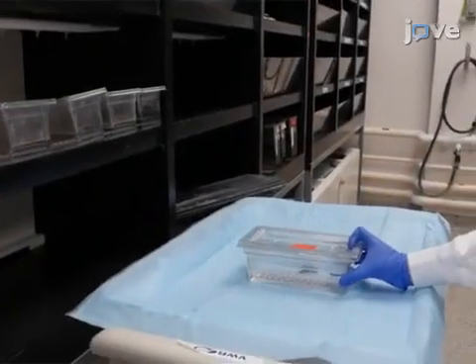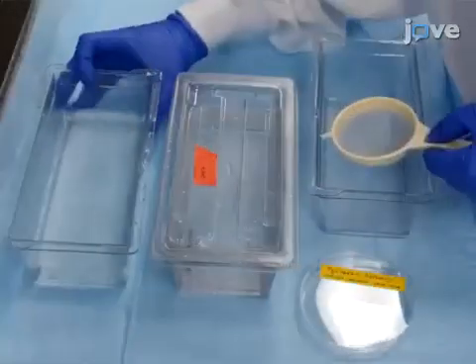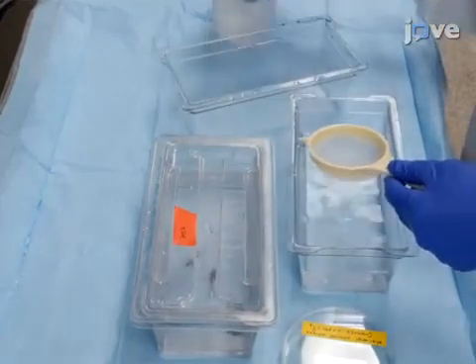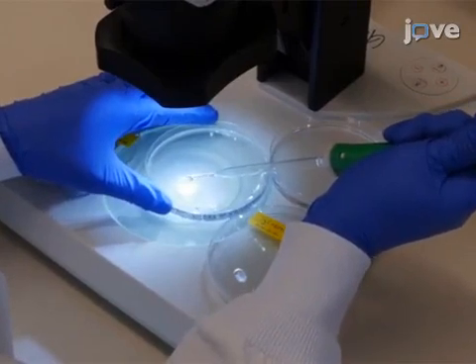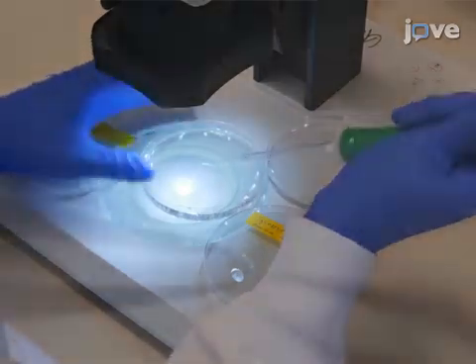After breeding adult wild-type and transgenic zebrafish, collect embryos at 15-minute intervals according to facility and institution-approved standard operating procedures. At least two hours later, transfer 100 to 300 fertilized embryos from a single time point into a new petri dish containing fresh egg water, and use fine forceps to manually remove the chorion from each embryo.